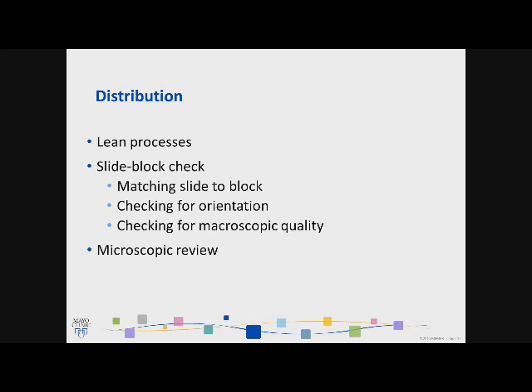Distribution is probably one of the most difficult areas to work in. We do have a lab aide doing this process. It's after the slide is cut, stained, and we are distributing it out to our consultants. All of the cases then are placed onto a slide, which I know you all are well aware of. We then go back into the system and assign it to a pathologist. We have to also place all the immunostains and ancillary tests with that.